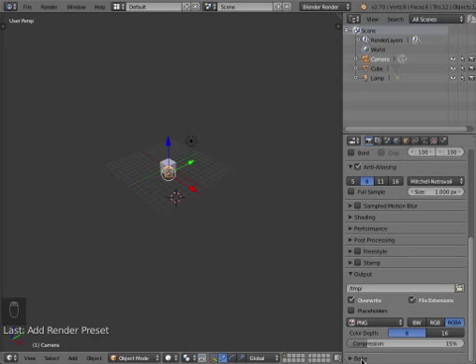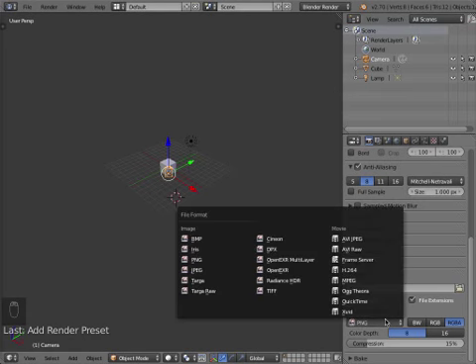And then the last important choice is what sort of file format we're rendering out to. PNG is going to be different from movies or images. Usually we either render out to PNG or TIFF, mostly PNG, occasionally JPEGs, and when it comes to movies, MPEG or QuickTime.